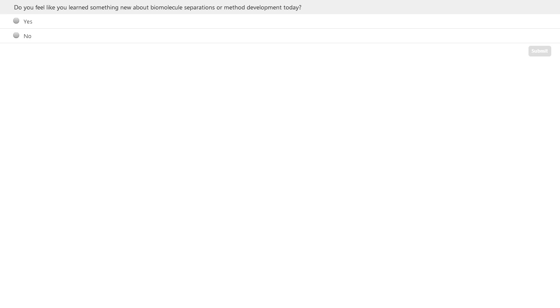Okay. Next question. Is there a mode of chromatography that you recommend for the analysis of biomolecules? In other words, RPLC or HILIC? It depends what you want to do and how hydrophobic your proteins are. If you've got more hydrophobic proteins, then reverse phase is going to be best for you. If you've got more polar, more hydrophilic proteins that are coming out early when you try them on a C4 column, for example, then I'd move to HILIC because you'll get more retention and therefore more chance of separating them.